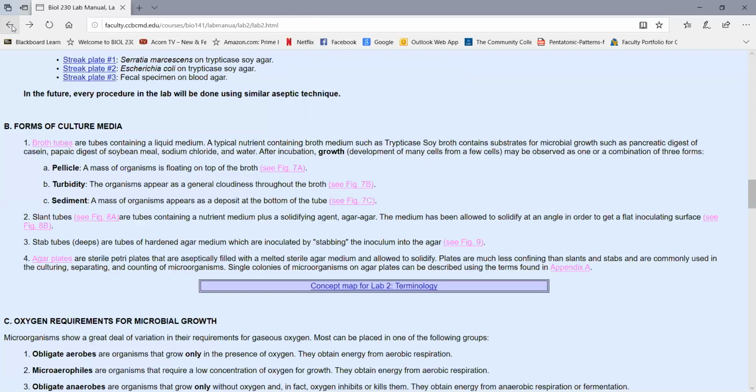In lab 3 coming up, we're going to be given a mixture of bacteria, and we're going to try to get pure cultures of each. We do that by looking for single colonies of each organism in the mixture, and often those colonies will look different because different bacteria produce different looking colonies. This also allows us to recognize if some airborne contaminants landed on your Petri plate when you're inoculating it, because often the contaminants will look different from the other bacteria you are growing.